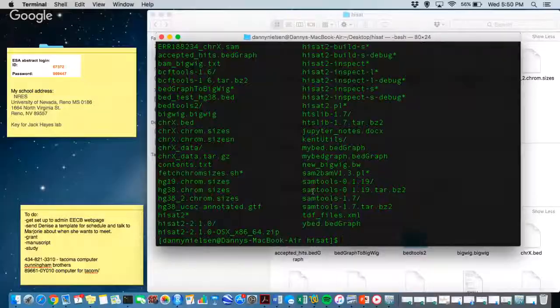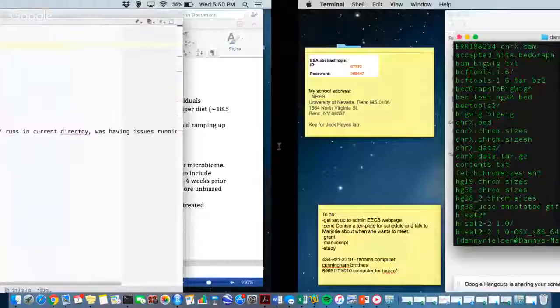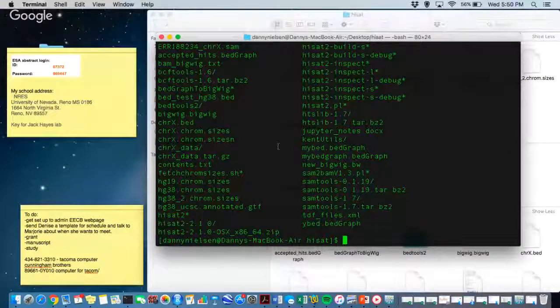Now, the next step, and I actually found, and I don't have it on this computer because I'm using 2 different computers. And so on my desktop here is where I've got some other resources I found online. But to create a bigwig file, I needed a bedGraph file. So what we just created was a bed file, and a bed file is just quickly here.